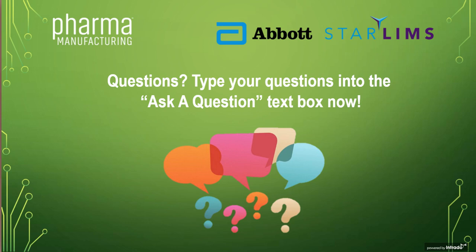You have a mobile application for result entry and also for sample collection. And we have a library where we keep those, what we call the content library. If you're interested to know what those are, I'm not sure if they can shoot an email for the attendees, and we can provide information directly on what mobile apps we have, but basically you can create your own.